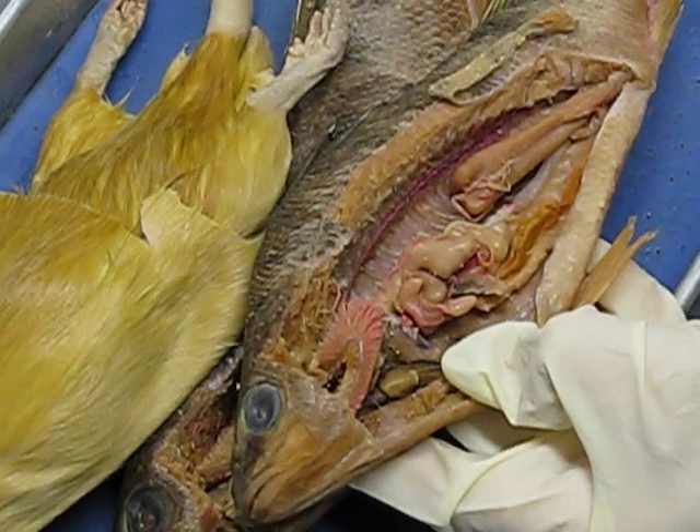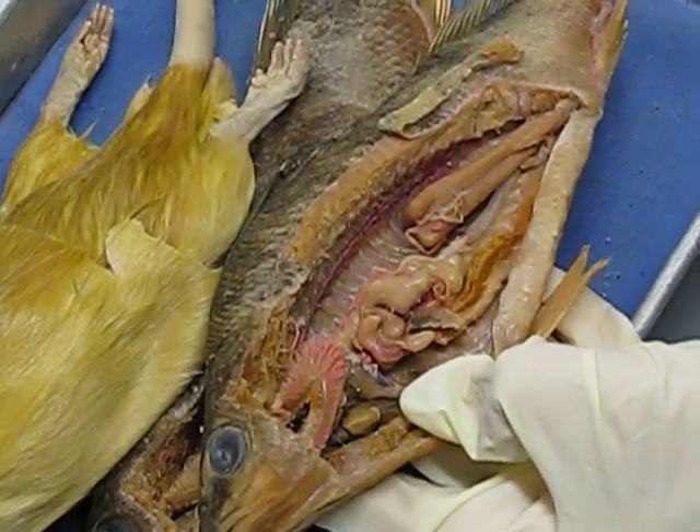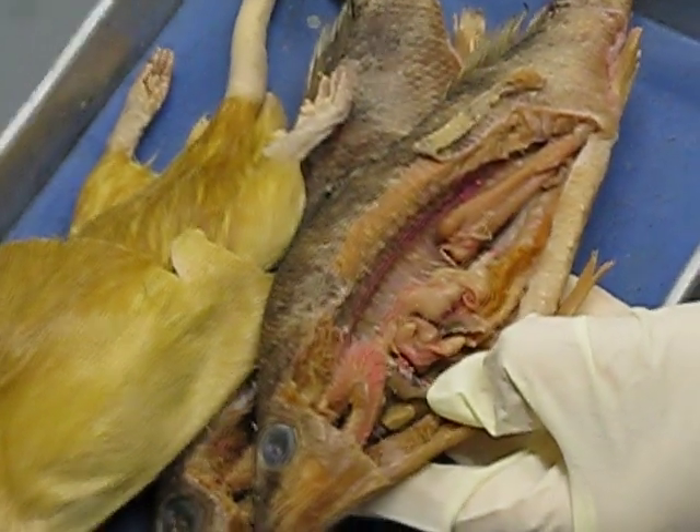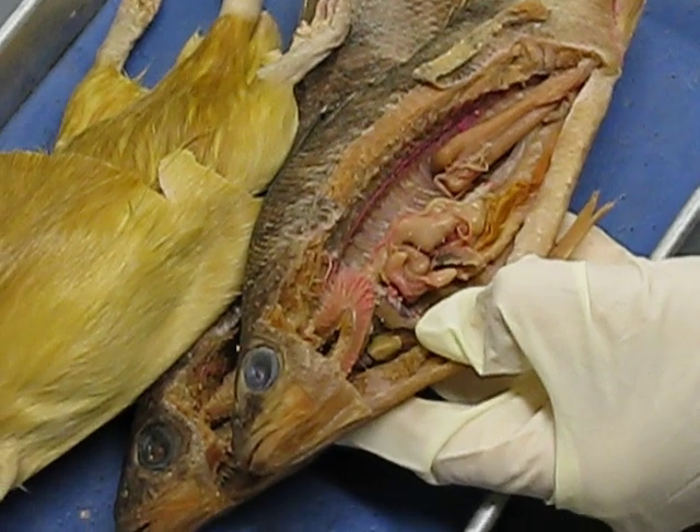Don't worry about trying to find the afferent arteries — they're not going to be dyed. You might want to get a picture of this, because this is actually the blood flow showing where it goes.